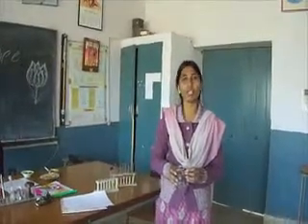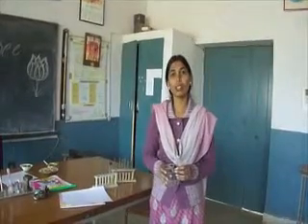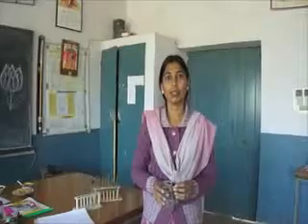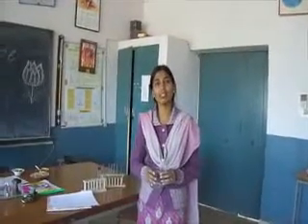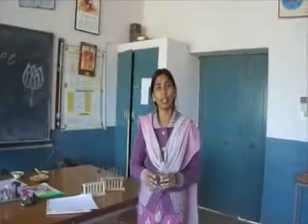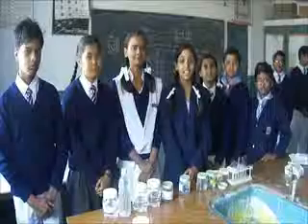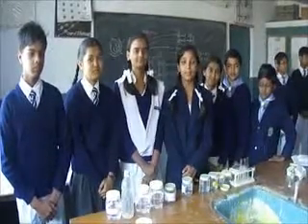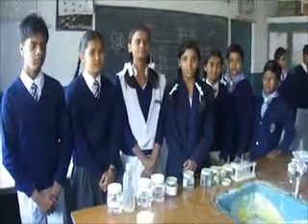We are testing the presence of fluoride in water. As we know, fluoride is very dangerous for health, so its presence should be detected and it should be treated well to avoid future problems. Now my students will perform some experiments to detect the presence of fluoride in water. This experiment deals with the presence of fluoride in water, with the main focus on groundwater.